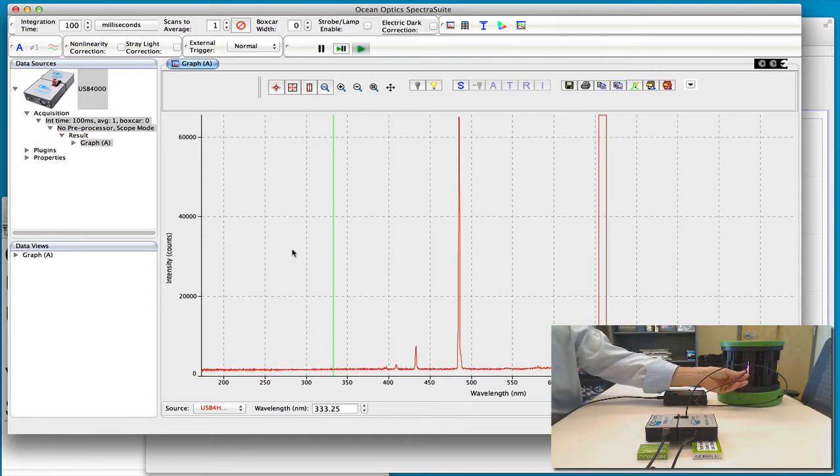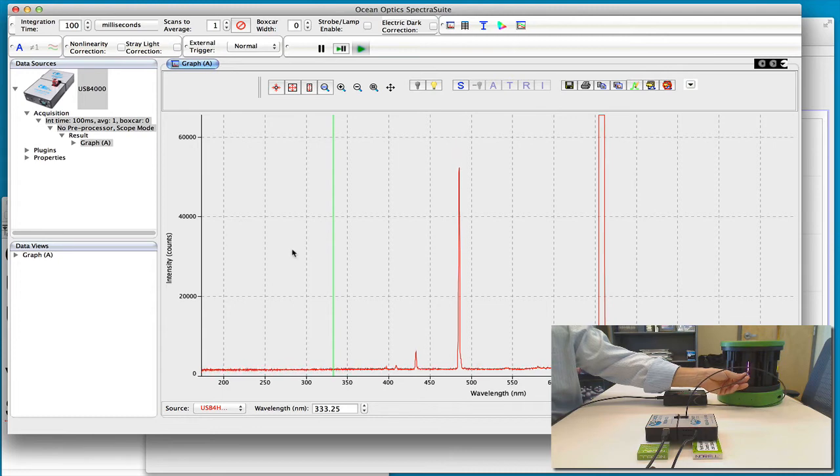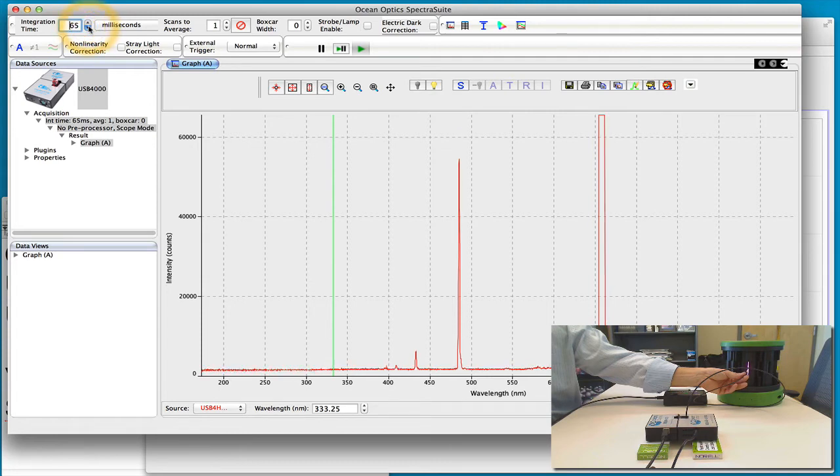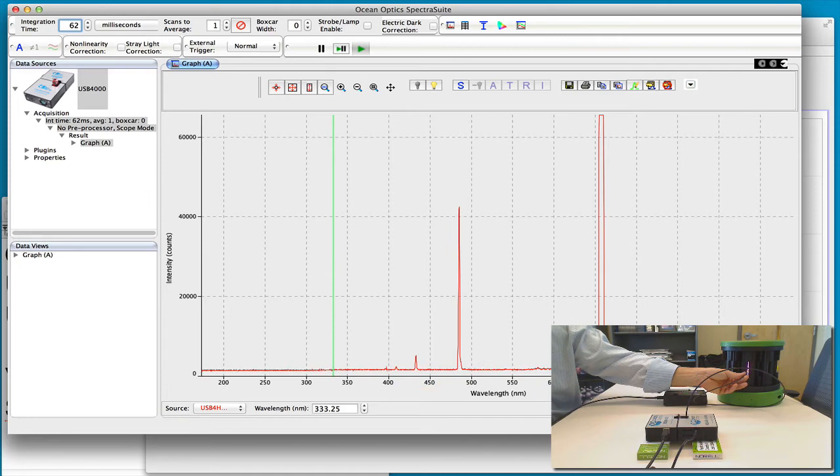And you'll see that we can easily start to get the emission lines from hydrogen. In fact we can go down, we're integrating for 100 milliseconds here, we can integrate lower and lower. So you can see we can get each of the characteristic Balmer series hydrogen emission lines.